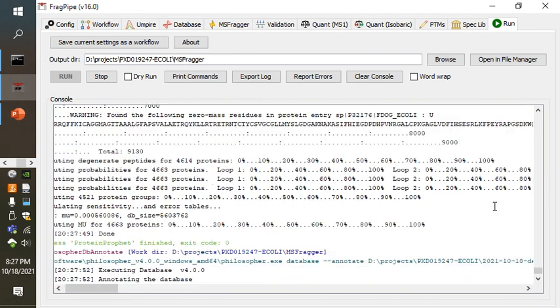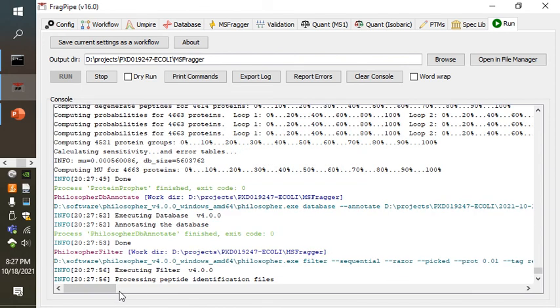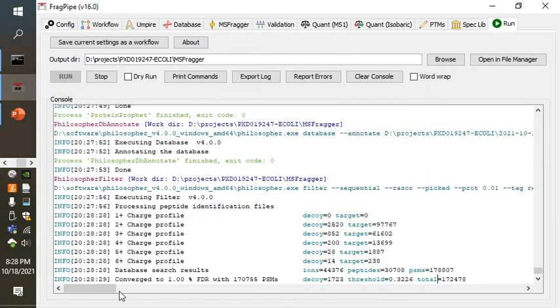So you might say, well, gosh, pepXML has been superseded. We now have this new and cool mzIdentML format. Shouldn't we be writing everything in that? But the truth is, there's a world of software out there that can still make effective use of the pepXML format. And frankly, you can read a lot of these pepXML files and write mzIdentML files if you really wanted to. So it's not as though everything old is superseded and shoved aside. There's a world of software out there that still makes use of these old formats, and we haven't just discarded it.